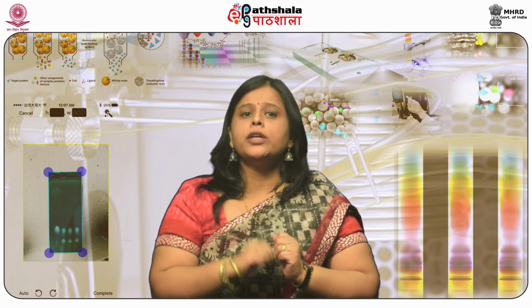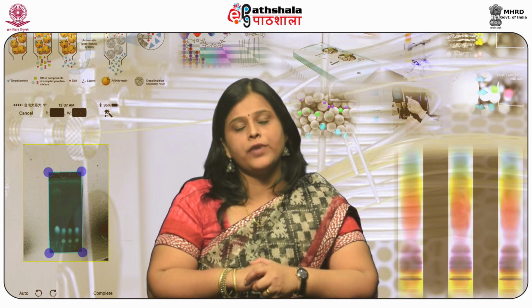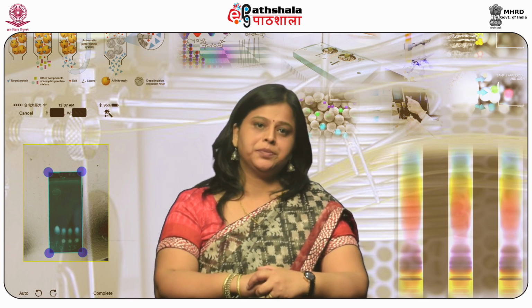Supercritical fluid chromatography uses supercritical fluids as the mobile phase. Usually, carbon dioxide is used as the mobile phase because the supercritical state of carbon dioxide is achieved at comparatively mild temperatures and pressures. Supercritical fluids have properties that are intermediate between gas and liquid, and hence supercritical fluid chromatography can combine the beneficial features of HPLC and GC.